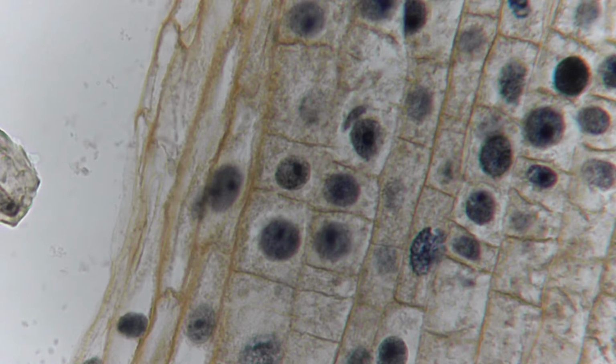Now, don't draw that dark purple spot. Just don't even draw that in. That's a structure that we're not going to deal with. It's a nucleolus, but don't even draw it in. The whole big round purple thing is a nucleus with a membrane around it and the stuff inside, the chromatin network.